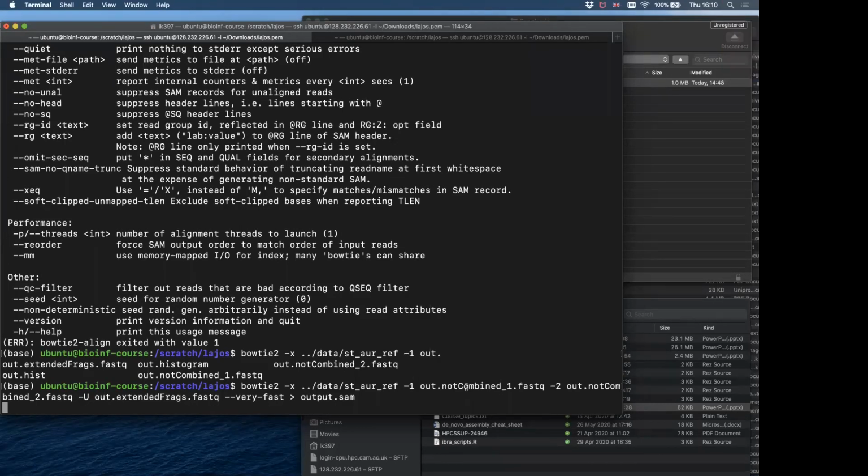All right, I got it. And another question about the procedure of how to deal with these files. Usually you get the paired ends and merge them, and then align them with the reference sequence.